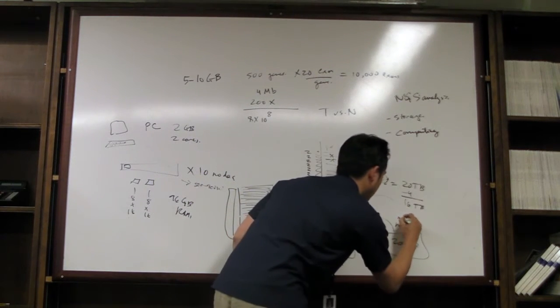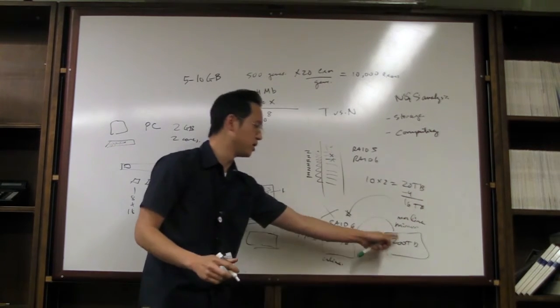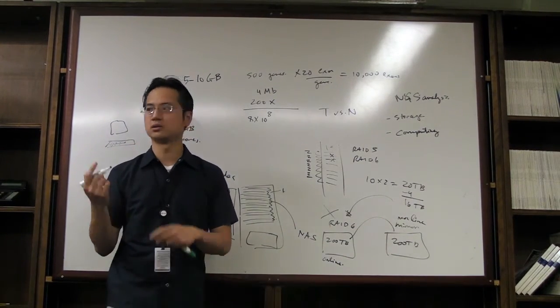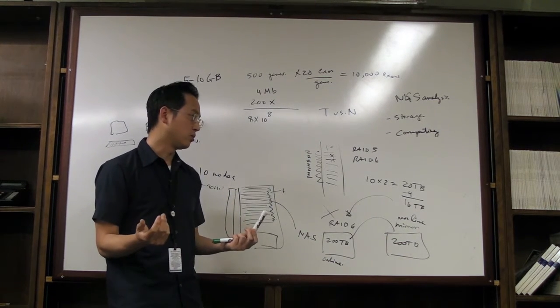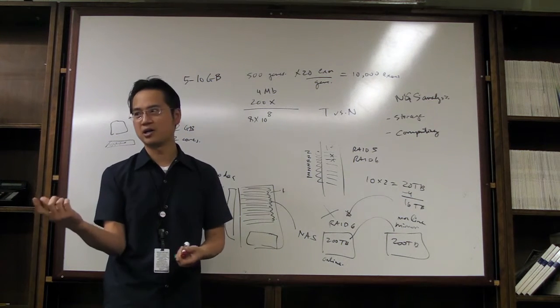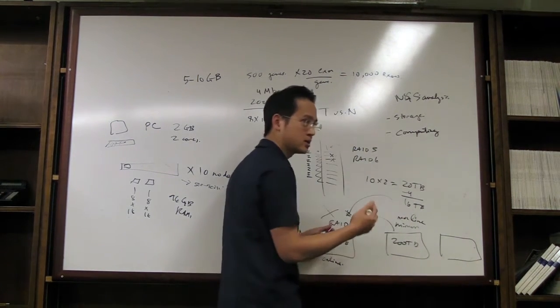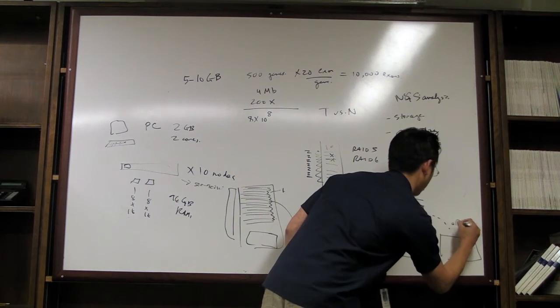So this will be maybe near line storage. So if this fails, we can rebuild this back very quickly by just transferring data. That's a lot of data to transfer. But then with clear regulations and pathology and clinical testing, there might be a rule that you have to keep this data around for 5-10 years. You know, slides you're supposed to keep around for 10 years, right? If there's such a rule, and we can't trash any of the raw data, that means you need offline storage.